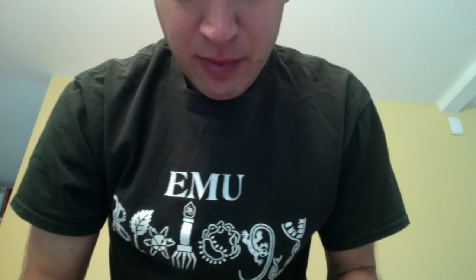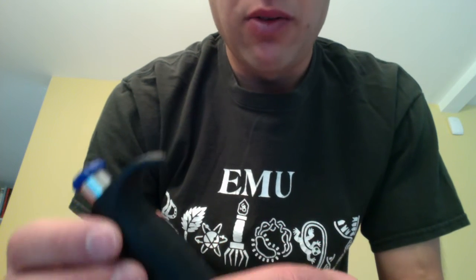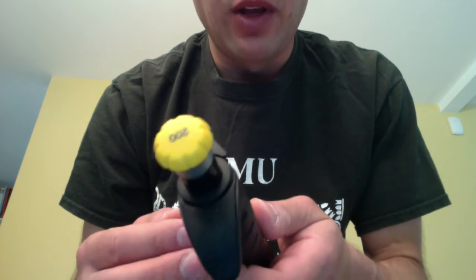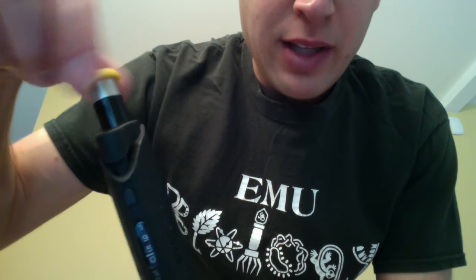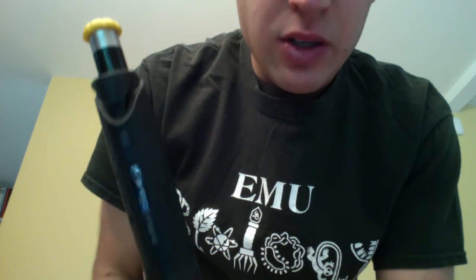Now that we've seen the digital displays, let's learn how to set these micropipettes — it's very easy and they all work the same way. I'm going to set the 200 microliter micropipette to 150 microliters. Right now it is set to dispense 195. It's locked in there, and you know it's locked because when I turn the button, the digits don't change.